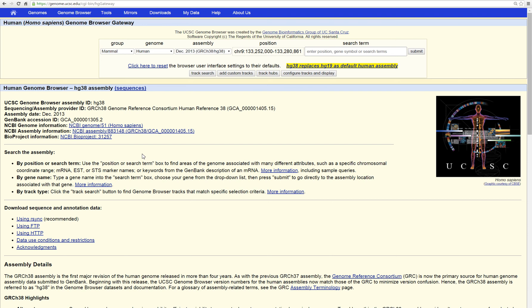This is Matthew Thomas. I'm a genetic counselor at the University of Virginia, and I'm going to review how to look up conservation data for a particular amino acid location and neighboring amino acid locations in the UCSC Genome Browser. I'll be focusing on whether an amino acid is conserved across other mammals and species, which suggests it's an important residue. Many in silico tools use conservation data to estimate the predicted disease-causing nature of a mutation or variant, and those will be summarized in other videos.